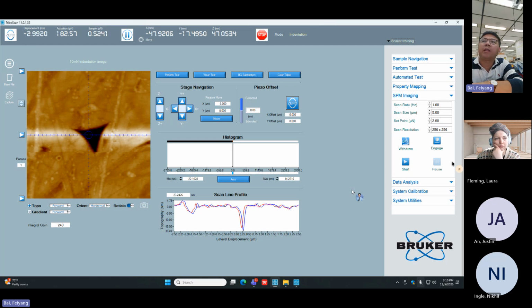So earlier we were thinking to coat it, we're coating our oxide material on the top, and then use our SEM to coat a small area of platinum on the top, and use FIB to cut a cross section, and then tilt it and view the section by section.